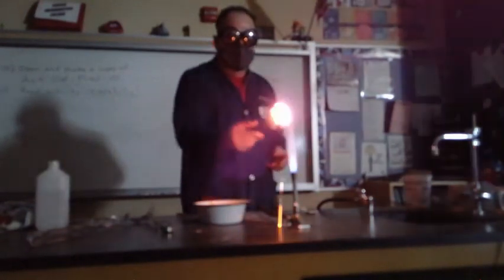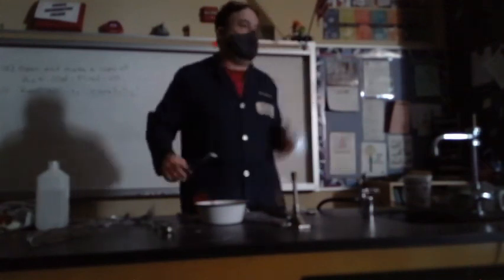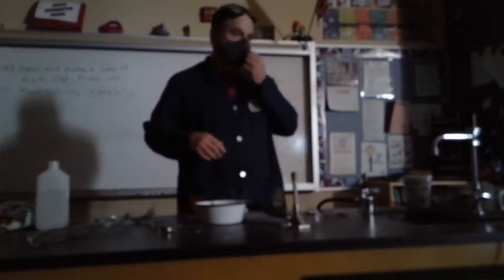And what's going on here is it's rapidly oxidizing. Now, normally when iron oxidizes, we call that rusting, if it does it slowly. I'm doing it quickly, so I'm just rapidly oxidizing it or rapidly rusting it. And that's that one.